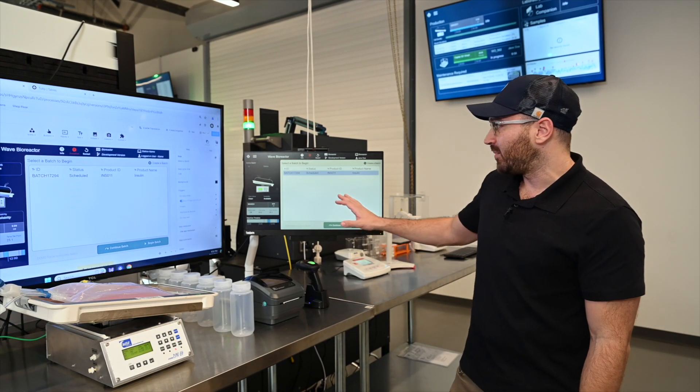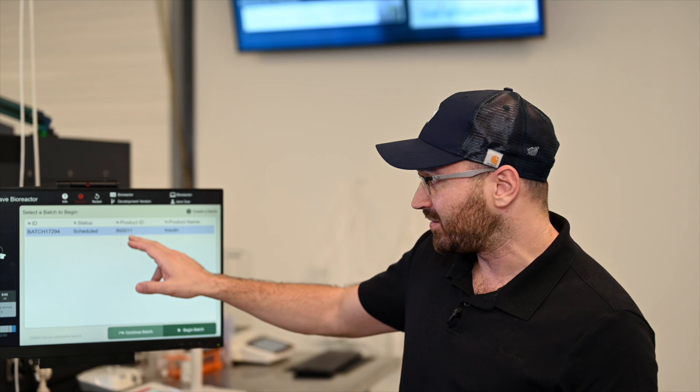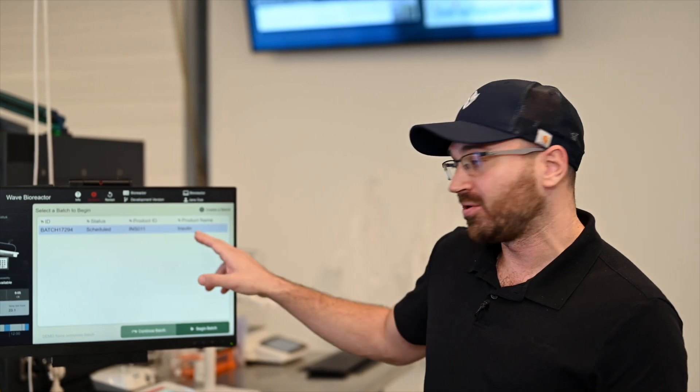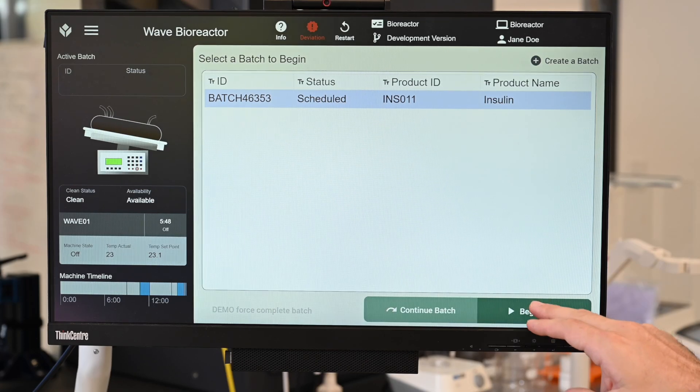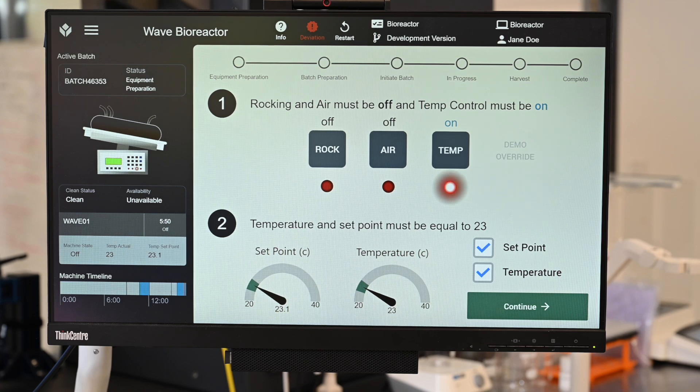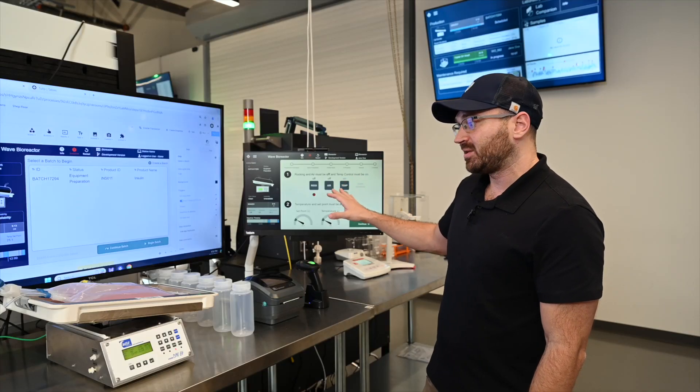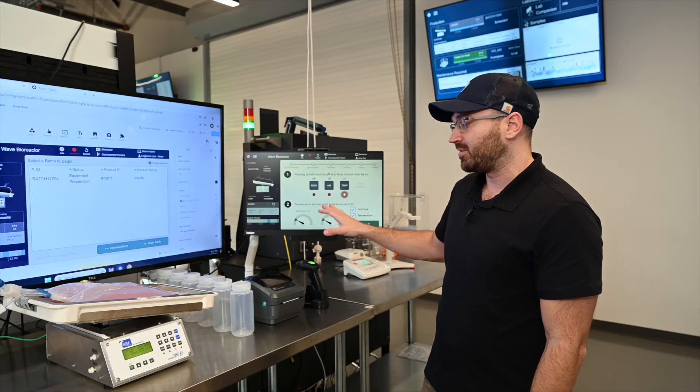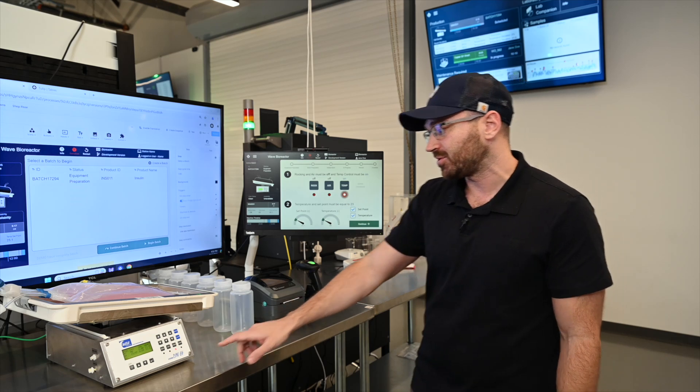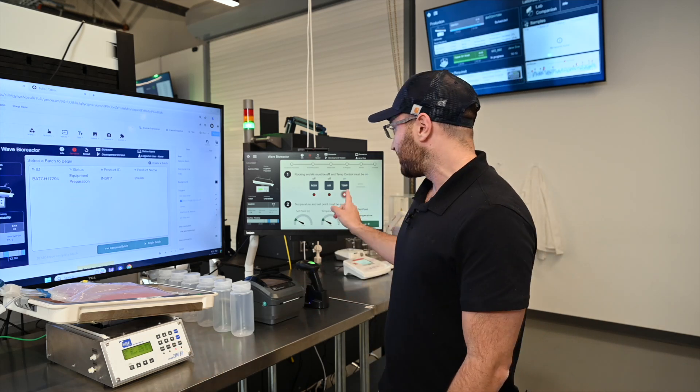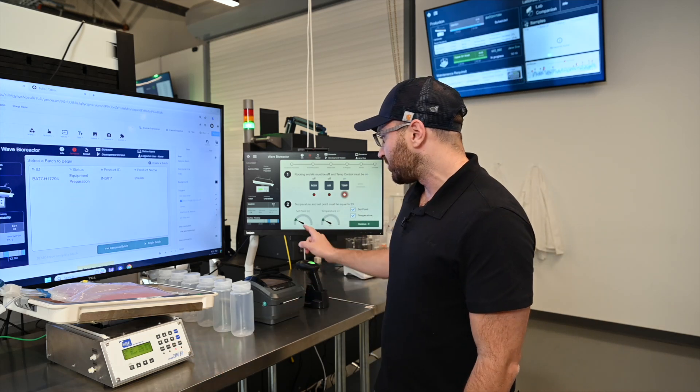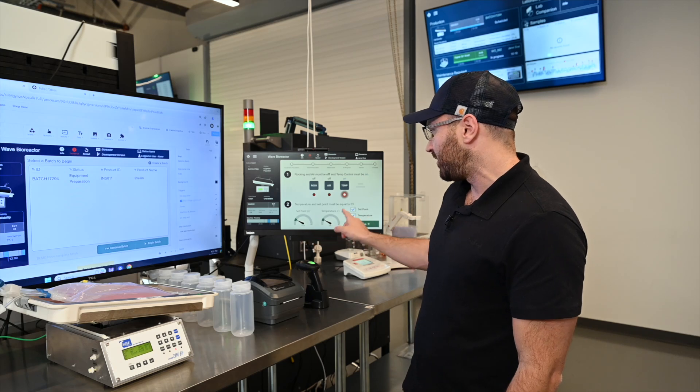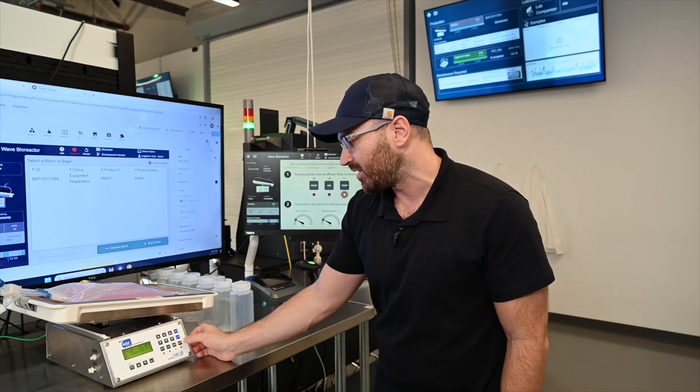So to begin this, I'm actually at the station and I can see that I have a batch that's scheduled. We're producing insulin, so I'm going to begin the batch here. We're connected to the wave bioreactor and this step is asking me to prepare my equipment. So the first thing I need to do is ensure that my temperature control is on, which it is, and the other controls aren't on. I also want to make sure that my set point is set to 23 degrees and the temperature is that way.